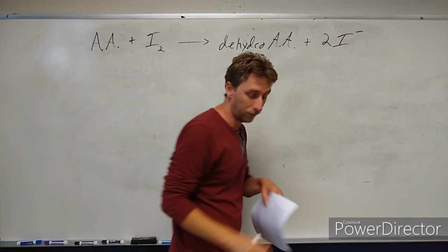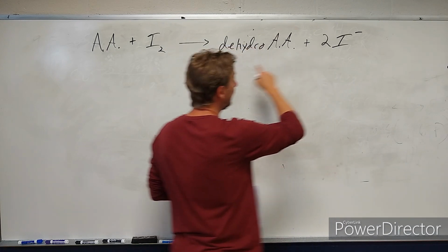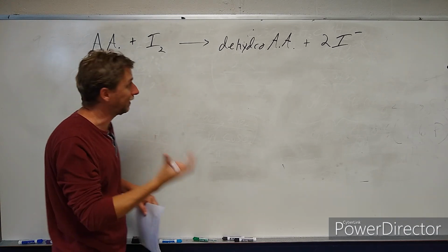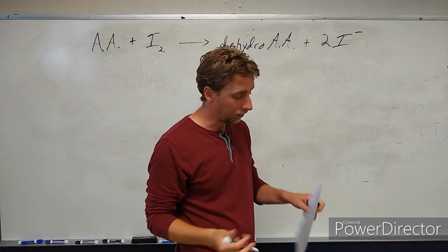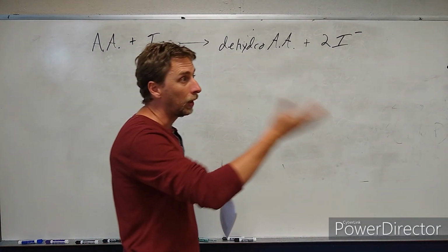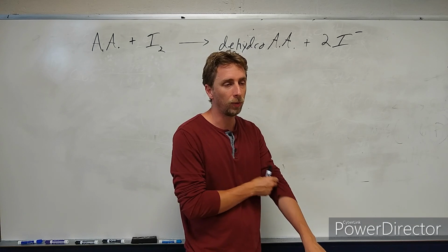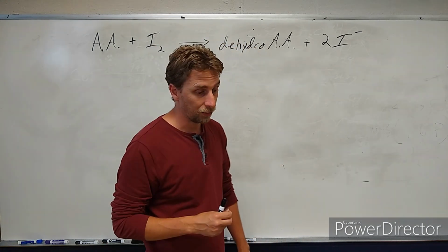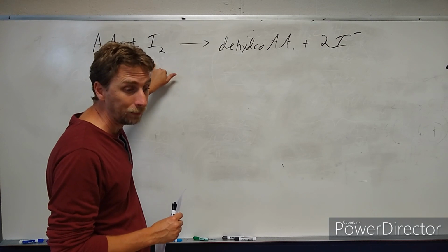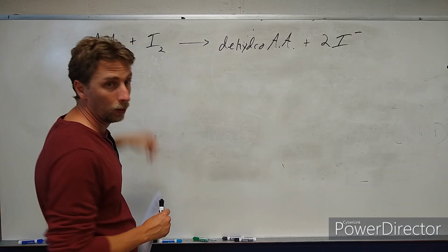Okay, this is a very simplified version of this reaction. It's not terribly complicated, but we just need the basics on here. And that's practically all we need for our interest. Mainly the idea, again, that 1 mole of iodine reacts with 1 mole of ascorbic acid. That's the main thing that you need for many titrations, is just how many moles of this react with how many moles of that, and then you can figure out the math that is relevant to what you measure in the lab. All right, how much iodine is required to knock out all of the ascorbic acid? And of course we want to measure it in the juice samples. So all we need to know is the concentration of the iodine that we're working with, the amount of juice that we start with, and the fact that 1 mole of iodine reacts with 1 mole of ascorbic acid.